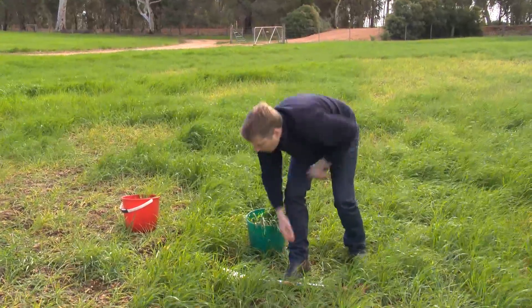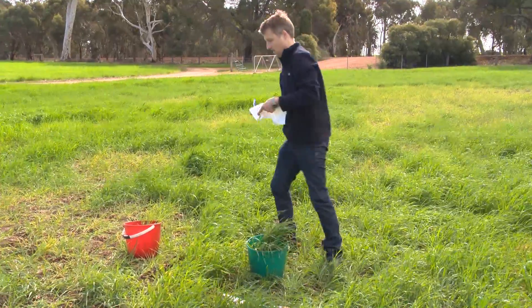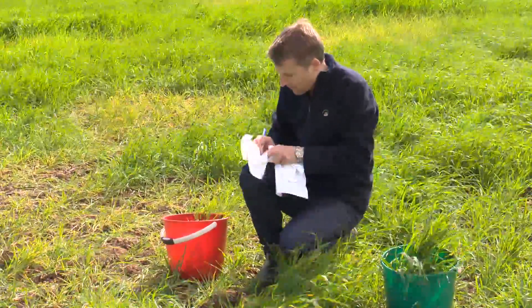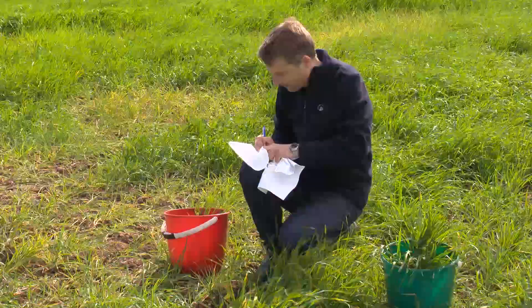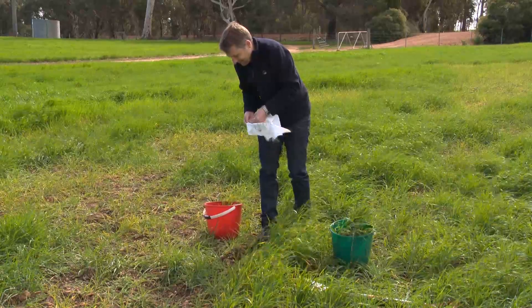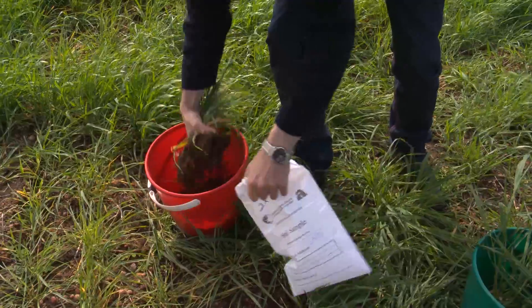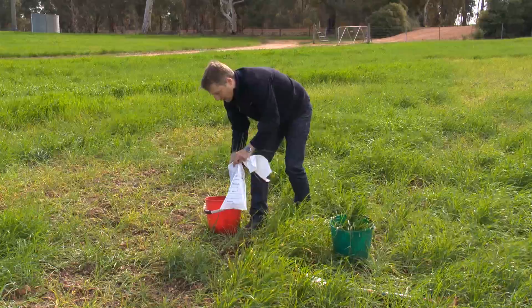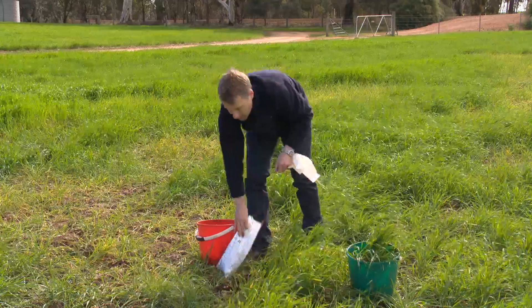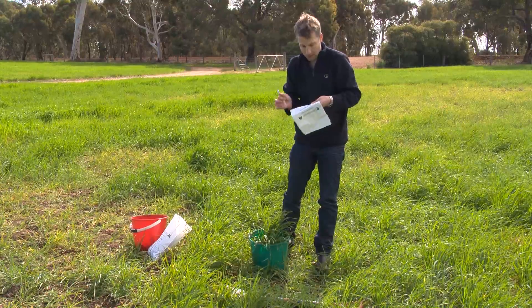When you've done that, you can put them in your bags, and you want to label them as well. You'll have two bags — one with the bad — and you'll write that on your bag. Make sure you've got all the material in there. You might actually need a bigger bag for some samples, depending on what you have.